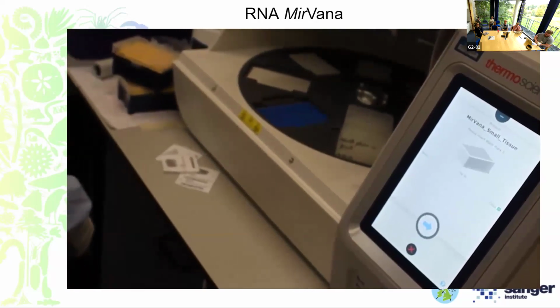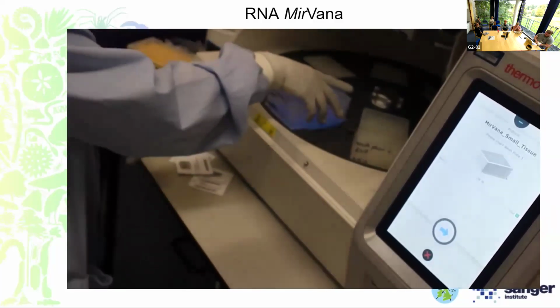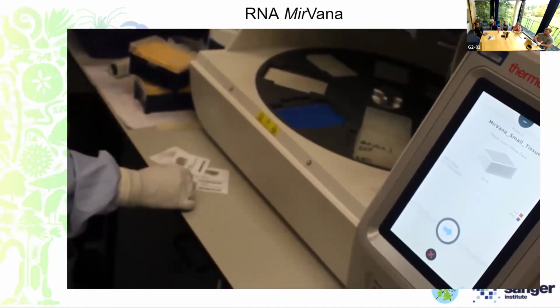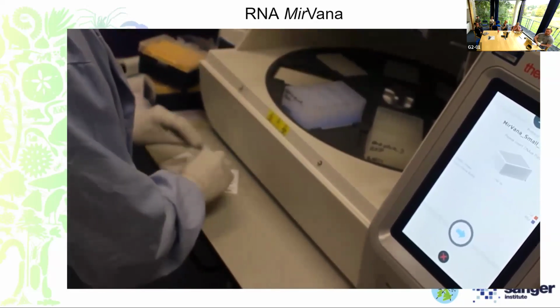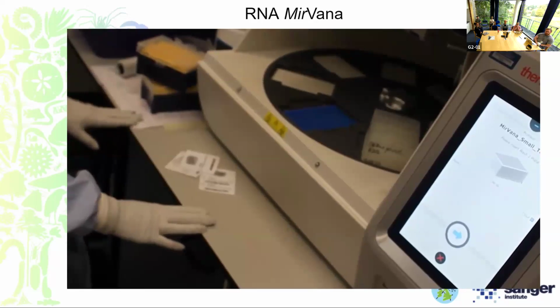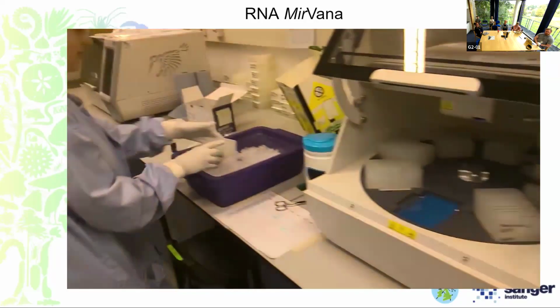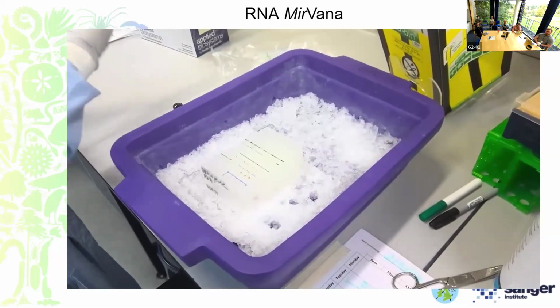And we like to keep the DNase plate on ice until it's ready to be loaded into the Kingfisher as well. But once you've loaded all your plates and you click run, the Kingfisher will start running, but there'll be a process that you'll see here in a bit where halfway through the Kingfisher will stop. Here we go. So yeah, halfway through the process, the Kingfisher will stop and it will prompt you to add isopropanol and a rebinding buffer to your DNase plate.